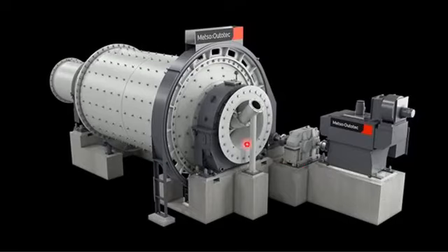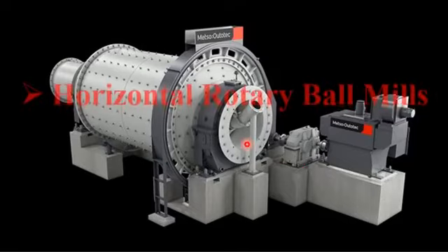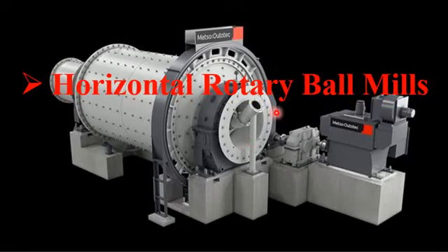Another type of ball mill machine is known as the horizontal rotary ball mill machine. It is clear from the name that the horizontal rotary ball mill machine is a rotational ball mill machine, and it rotates along the horizontal axis.